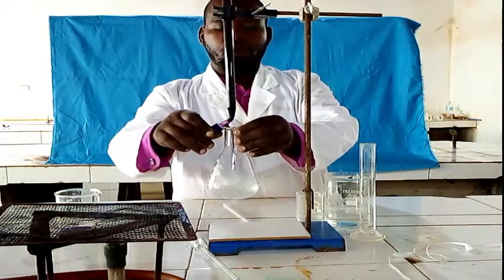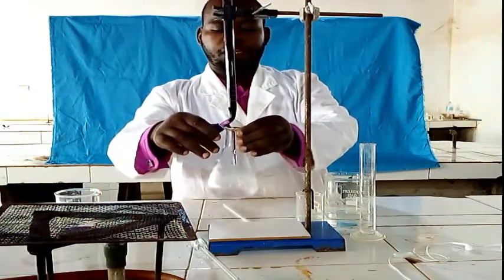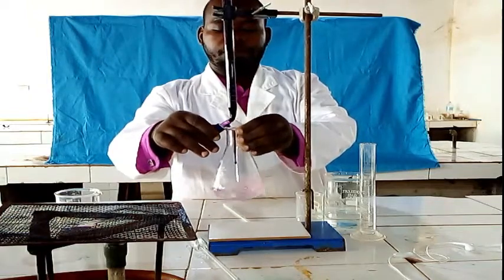That is the hot solution of oxalate and sulfuric acid.